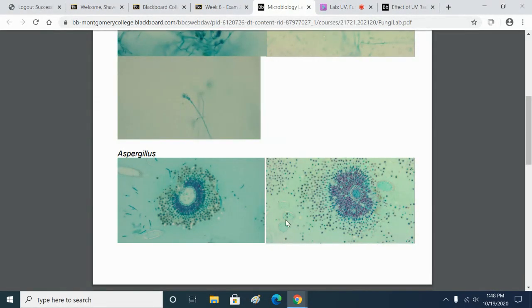When you take a cross section of the ball, this is what it looks like. All these little dots are the spores. Just imagine this as being a ball covered with spores, and you slice it and look at a tiny thin slice, and this is what you see. And here's another example where most of the spores have been released and are scattered all over the place. And that's just one little conidiophore.